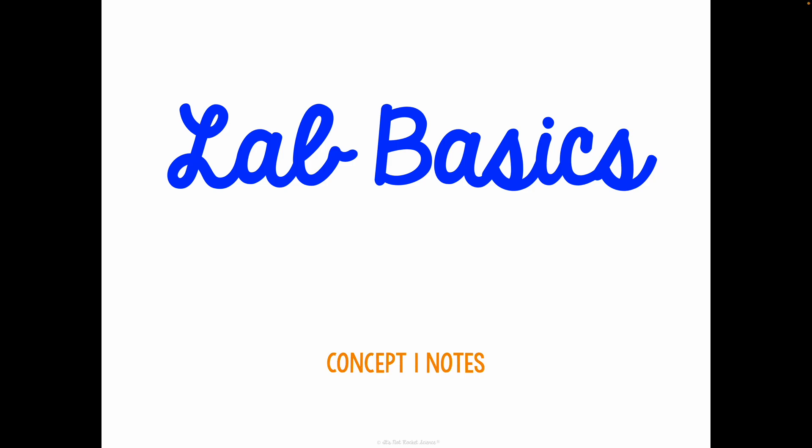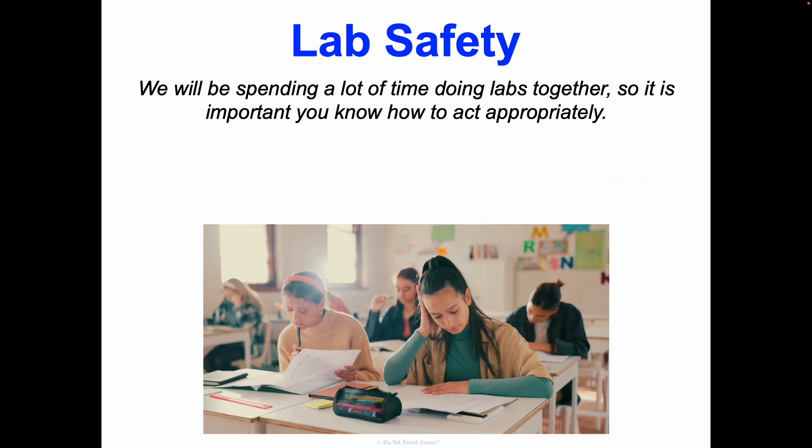Welcome to our Science Foundations unit. This is your Concept One Notes on lab basics. We are going to be spending a lot of time doing labs together this year, so it's very important that you know how to act appropriately in lab so that we can stay safe and you can actually learn from the lab what you're supposed to learn.